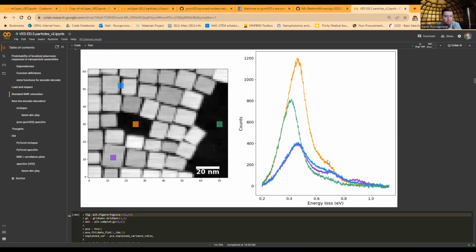That's just a simplified description of what spectral features might be present, but we can already understand as humans that there are differences that are more or less obvious. And particularly when you're directly on a particle, you have an extra peak here at the bottom right.